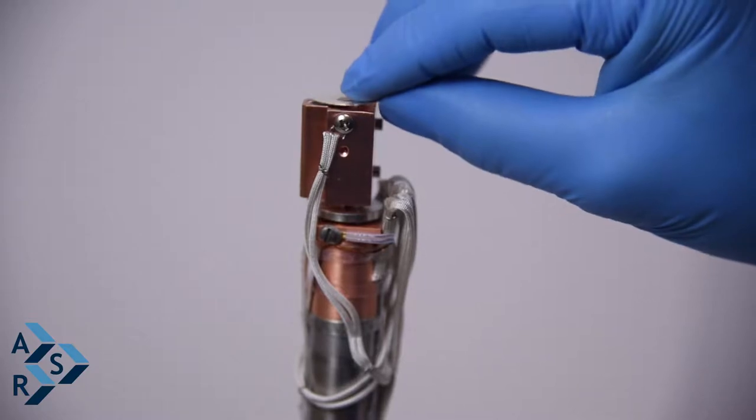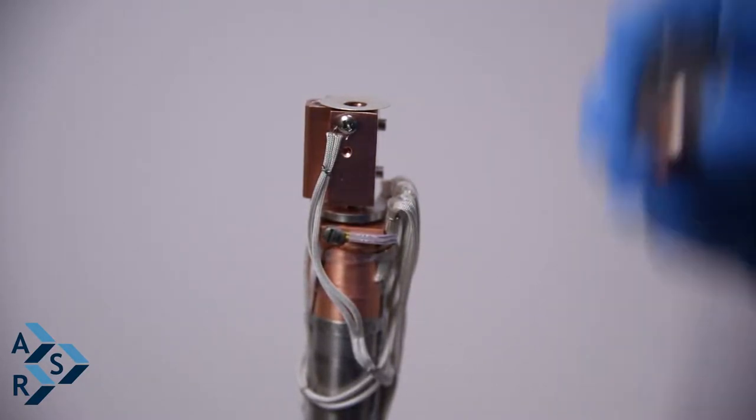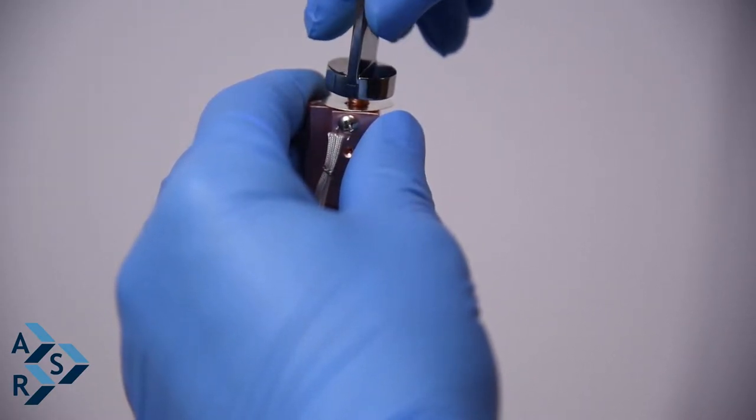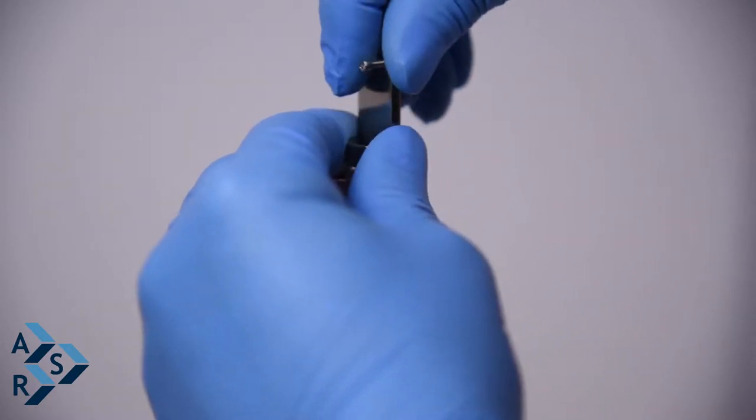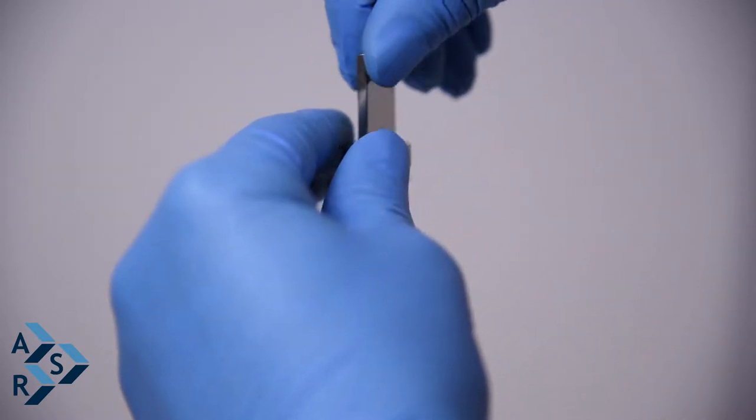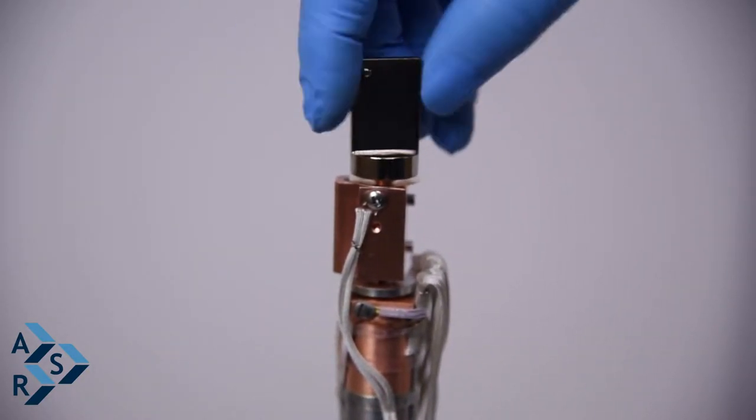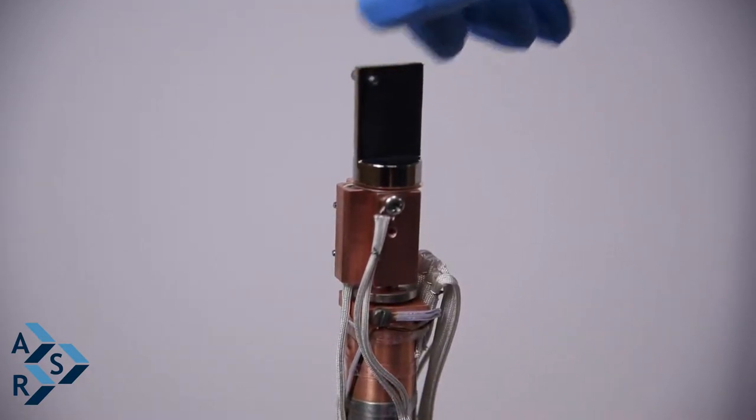So you have to use this silver gasket. Take your sample holder and start a few threads. Get it started, and when you turn it by hand, get it close to the position.